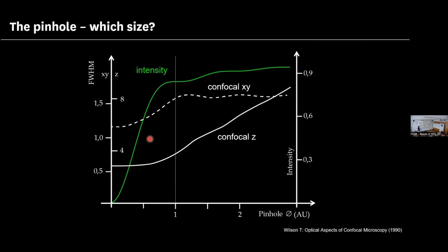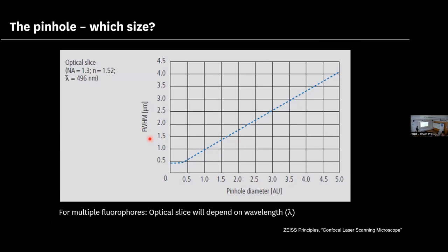Any questions so far? Yes. On the first question, you see that the diffraction pattern depends on the wavelength. So all these waves with the pinhole, and how do you calculate? This is a very good question because this will absolutely depend on the wavelength.